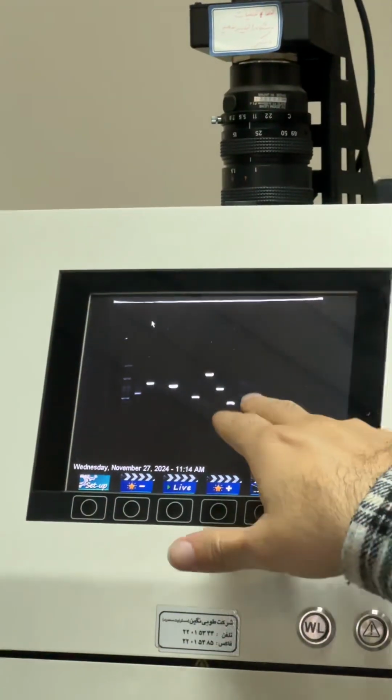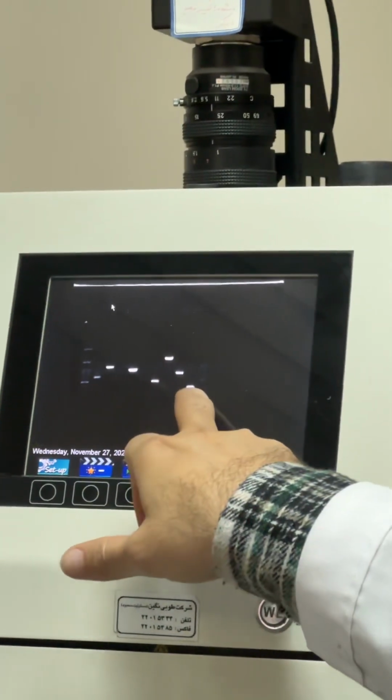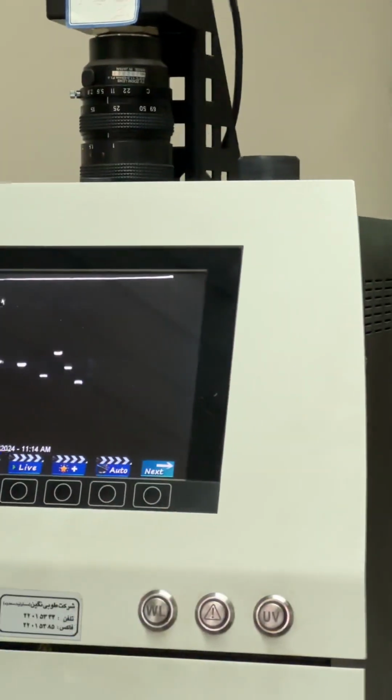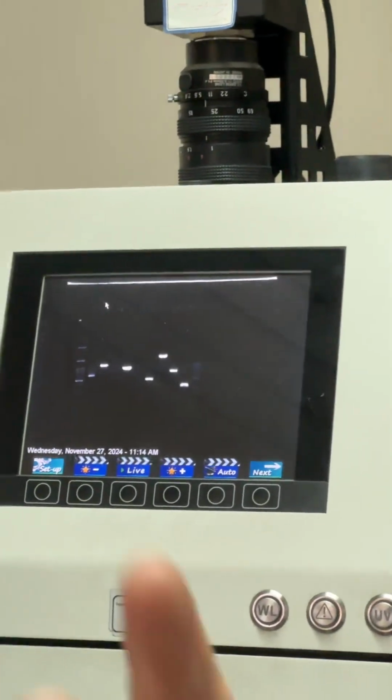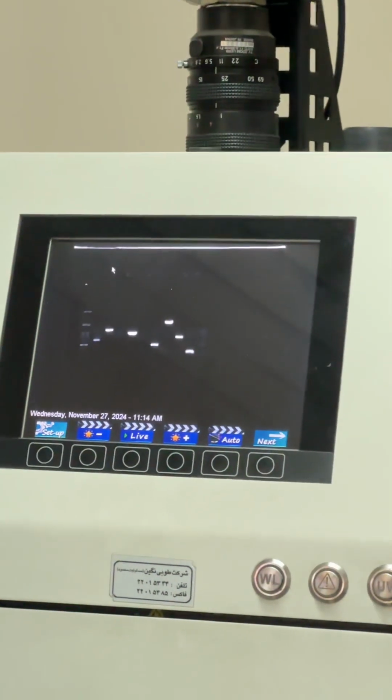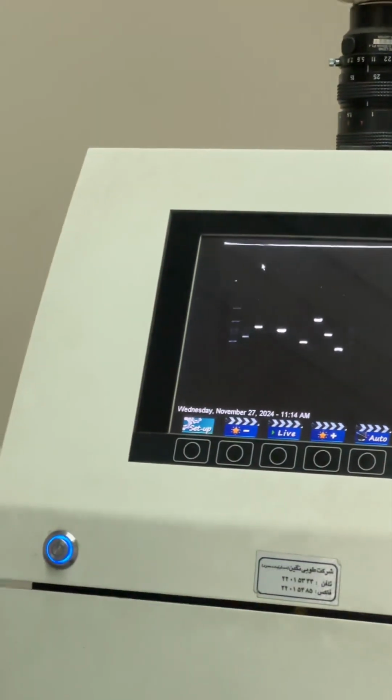With the PCR, just tell me, what does this band mean? It's the result of amplification. Very simple. Amplification of PCR. Okay? You understand? Very good.